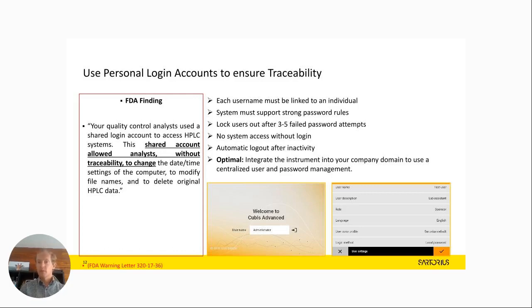That's why we are working here, as I mentioned before, with the user management and a clear access control. If you set up individual users in your lab, you need to do it one time when you buy the instrument, you create your 10 users, everyone gets an absolutely individual strong password with clear access rules. You get an automatic lockout after inactivity. So you set up the instrument so that before you want to use it, you need to individually access so the instrument knows who you are. And as soon as you walk away, the balance blocks you out. So no shared accounts, where the balance is still under the account from someone and you're working on it. Absolutely individual would work against this FDA finding.